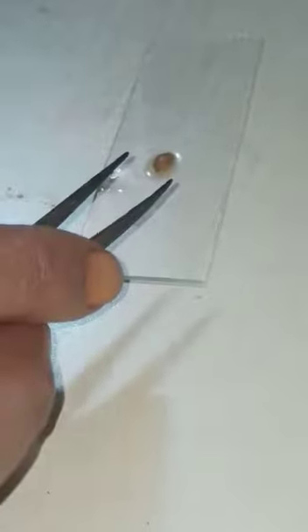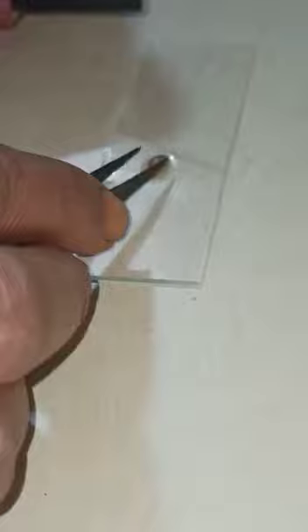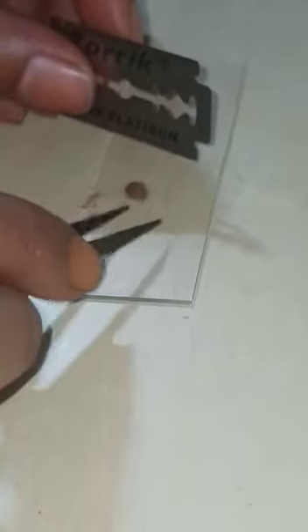Take the fruit with the help of a forceps and put it over the slide. Take a thin section.